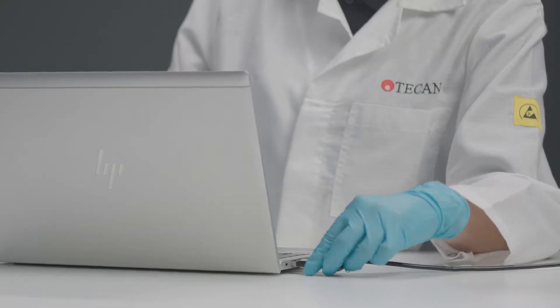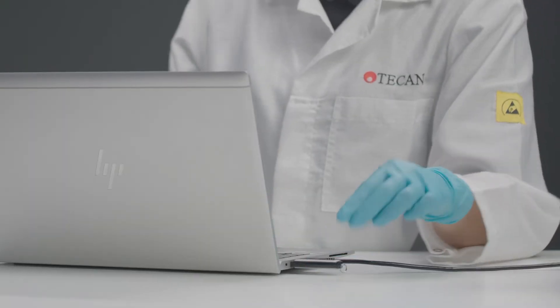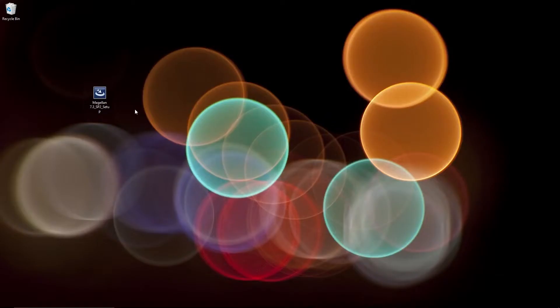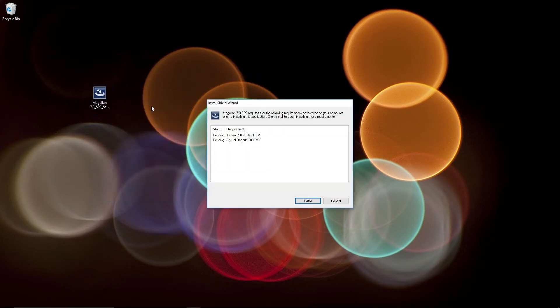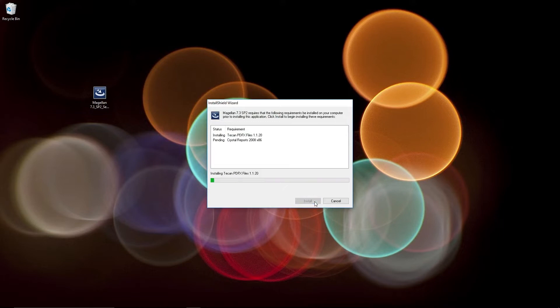Plug in the USB drive and transfer the setup file to your PC. Open the Magellan setup file. Use an account with full administrator rights to install the software. Then simply follow the instructions of the installation wizard.